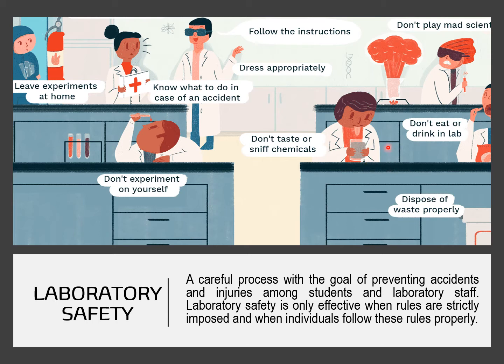Then we also have: do not eat or drink inside the laboratory. This is a very important precaution inside the laboratory that we do not allow students to eat inside the laboratory. If you want to eat, you can do it outside or in the pantry. And then we also have: know what to do in case of an accident.